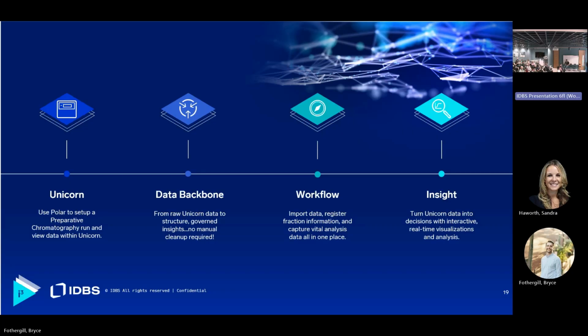I think the actual user interface is subtly different, but conceptually it's more or less the same. You'll have seen in the demo today, something slides in from the side. The user navigates, finds their data, clicks what they want, and brings it in. Those concepts are essentially the same, but fundamentally, how it works under the hood is slightly different. The end result you get to is basically the same thing.